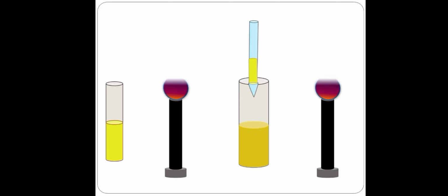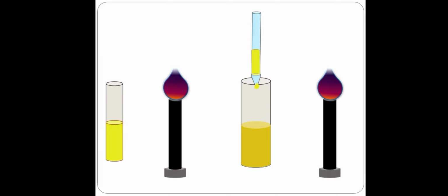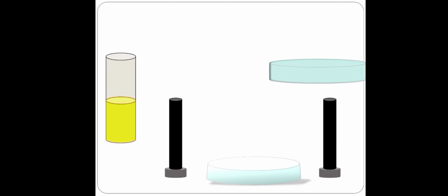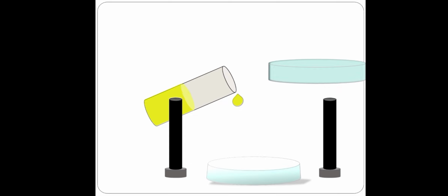As we can see, we are taking a sample from the microbial culture into molten agar between two oxidizing burners, maintaining well aseptic conditions to avoid contamination. Here we are pouring it into a sterile petri dish. That is why it is called the pour plate method.